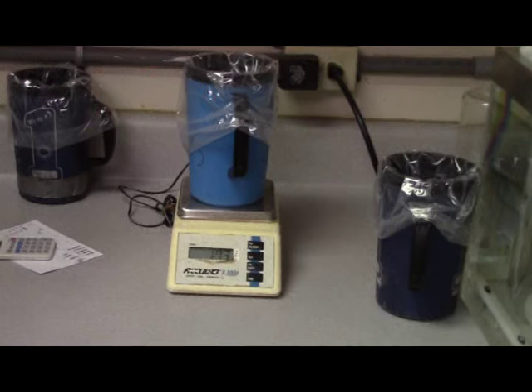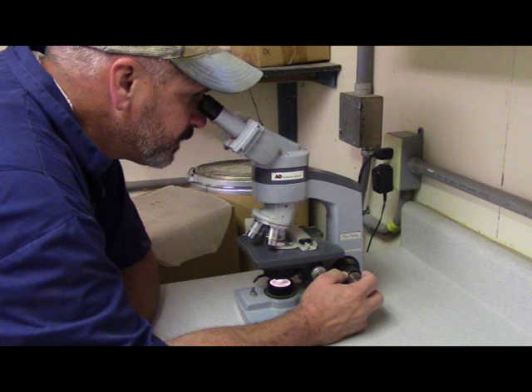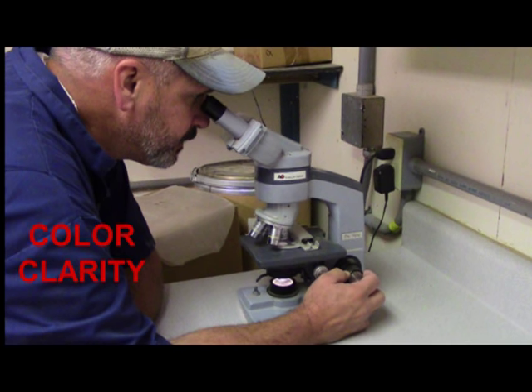Semen volume is easily measured by simply weighing the collection cup and bag before and after collection. The difference in grams between the empty and full cup is the volume of semen in milliliters that the boar produced. Determining total sperm number is more difficult, and getting an exact number requires the use of expensive laboratory equipment. For our purposes, we'll estimate sperm concentration and total sperm number based on the color and clarity of the semen.